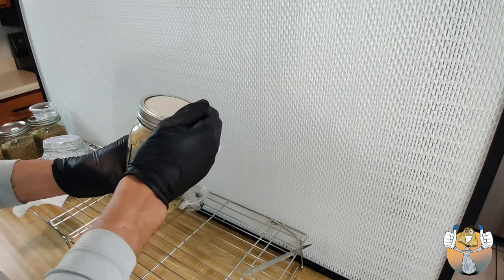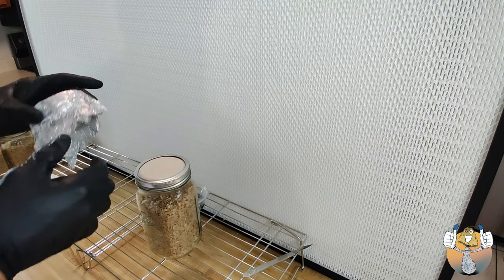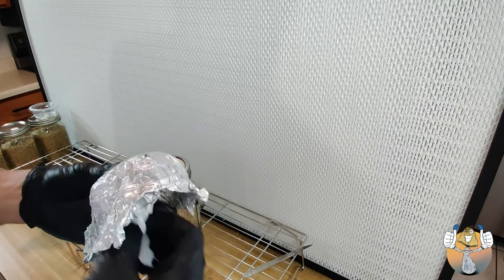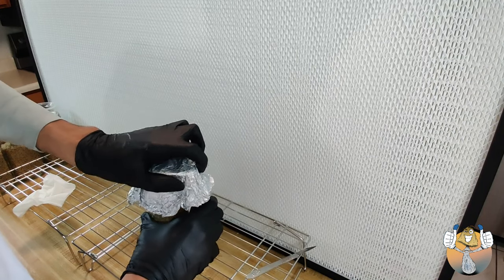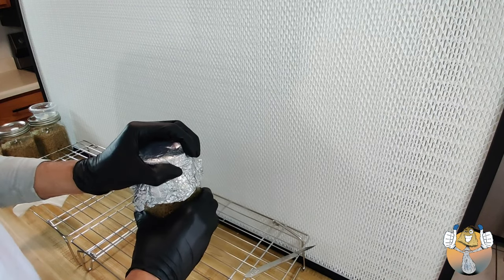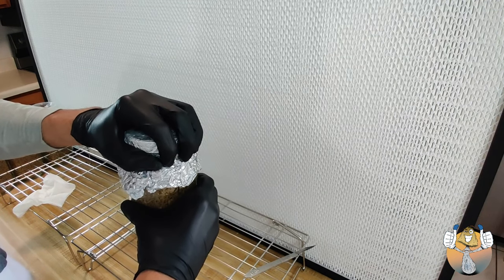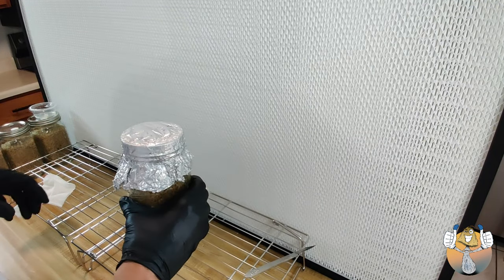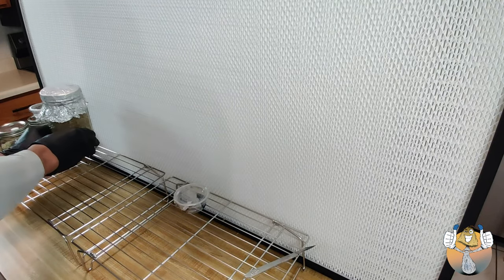We're going to go ahead and clean our jar with our 70% ISO. And we are placing the foil cap back on our lid to prevent any contamination from getting inside our jar. We're going to crack the lid with a little bit of a quarter turn, just so we have that fresh air exchange. And we're going to set these bad boys in our incubation box and check on them in a few days. Hopefully we have some beautiful mycelial growth, which I think we will. I have faith and confidence.